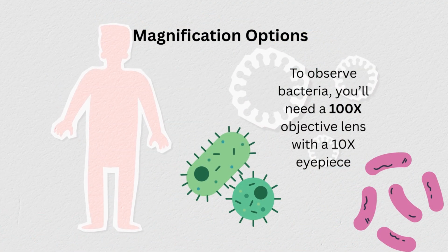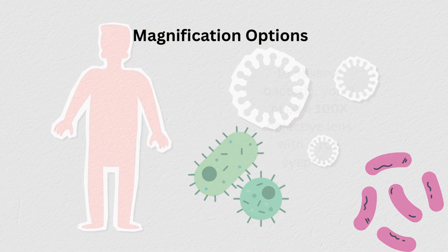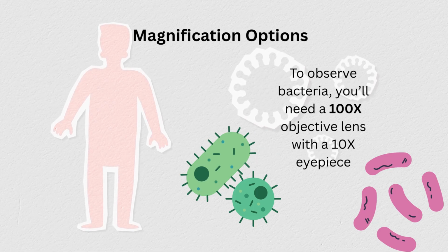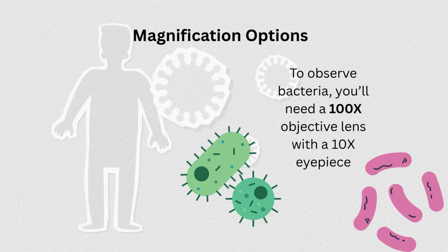Bacterial shapes can only be visualized with a 100x lens with oil immersion. These experiments raise safety concerns and are mostly not recommended for home setup.